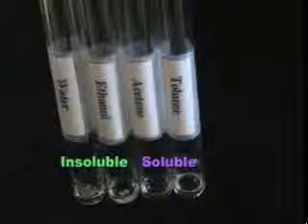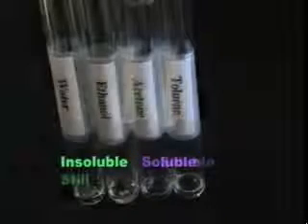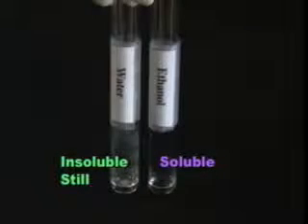The ideal solvent is one in which your compound is insoluble at room temperature, but soluble at the boiling point. Remember, at room temperature, naphthalene was soluble in both toluene and acetone, so neither of these will work. After heating, naphthalene remained insoluble in water, even at the boiling point. This means that ethanol is the solvent of choice. It dissolves the sample at its boiling point, but not at room temperature.